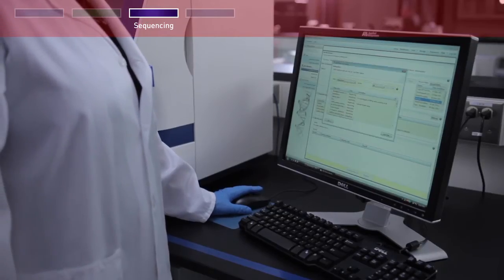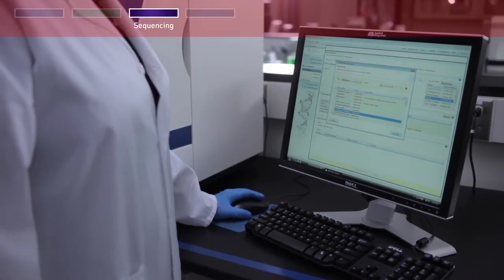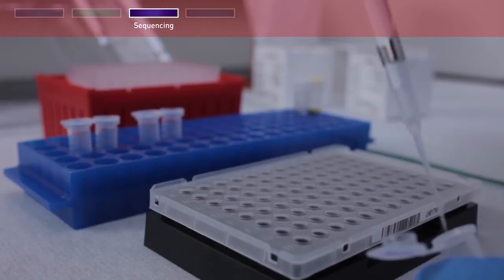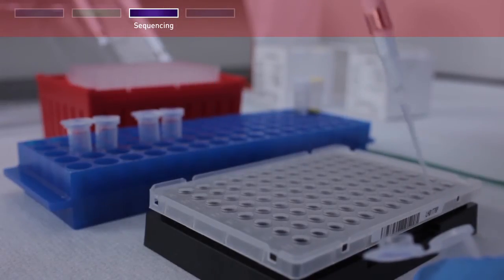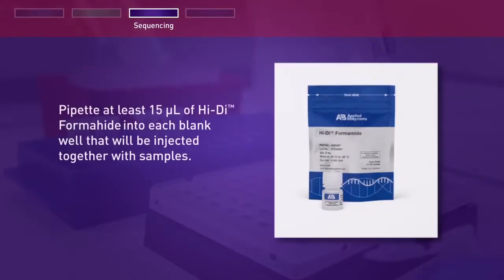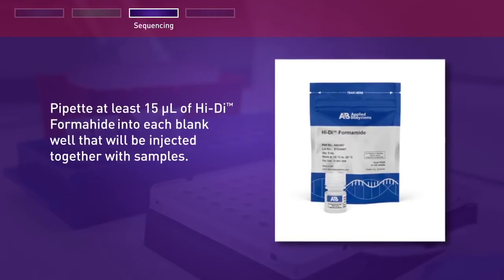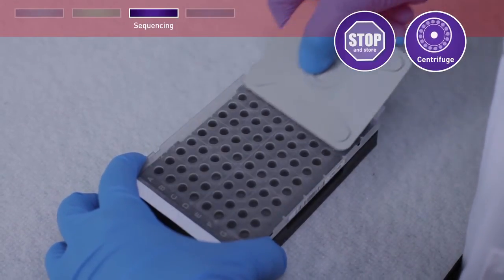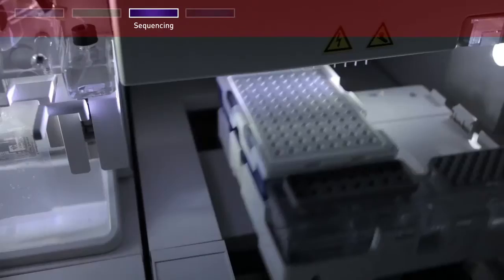Configure the instrument with the parameter settings shown in your protocol. Pipette at least 15 microliters of each purified extension product or control into separate wells in a 96-well plate. Pipette 15 microliters of Hi-Di formamide into each blank well that will be injected together with samples. Cover the plate, centrifuge, and at this point you can stop and store your reaction or load your plate and start your run.